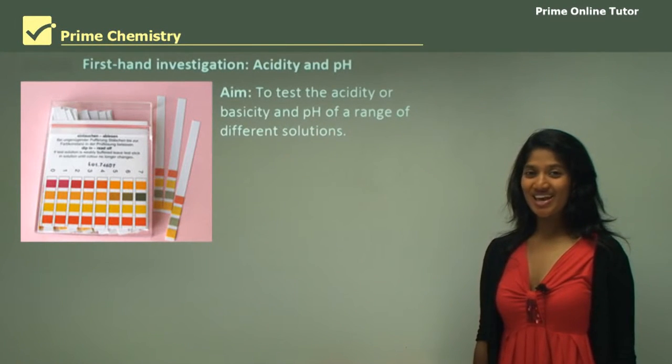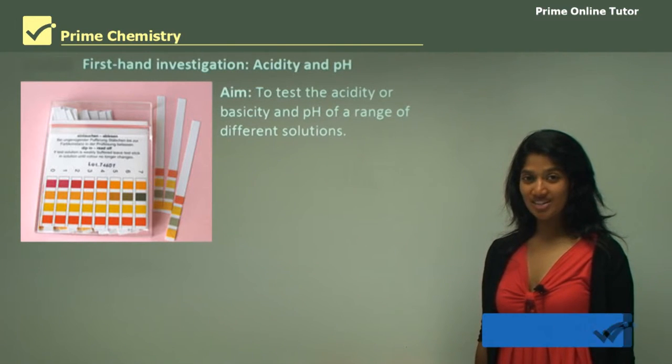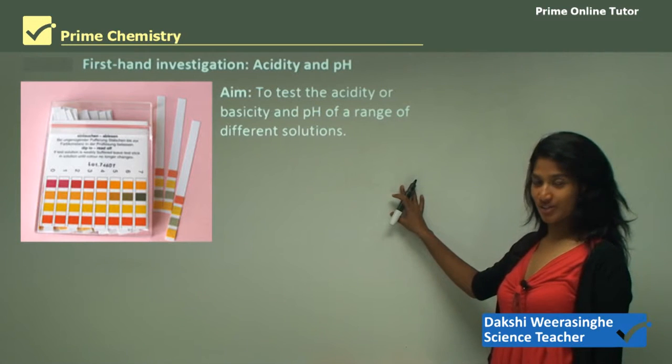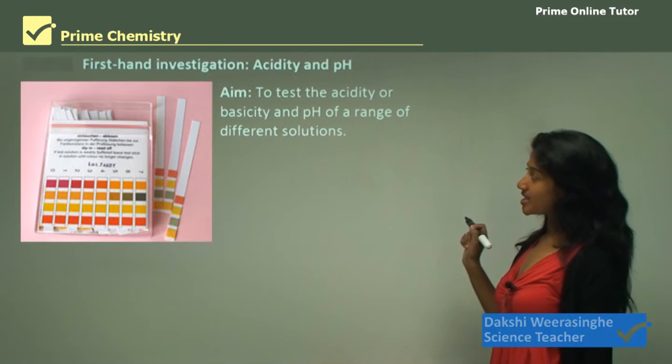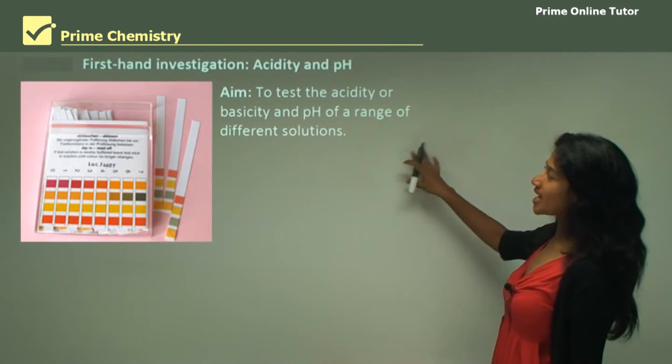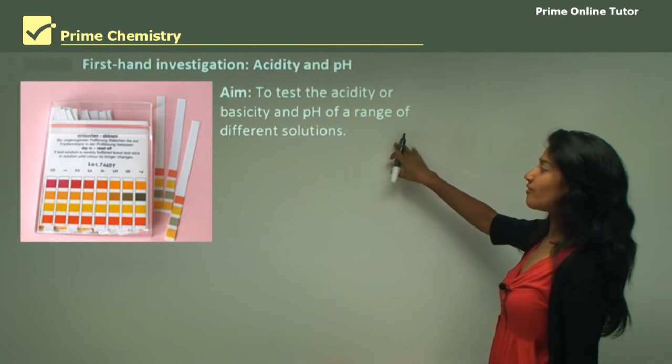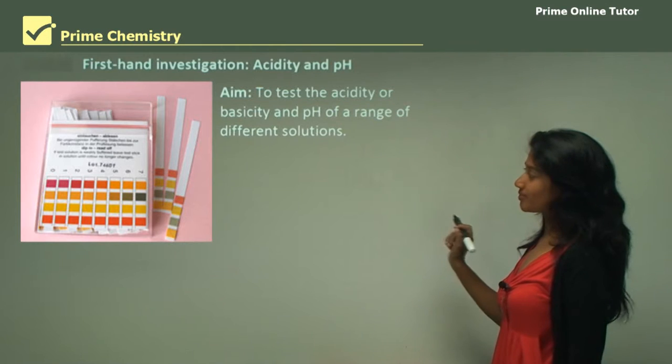Hello everyone, today we will be going through a first-hand investigation where we will be testing the pH of a variety of solutions. So the aim of the experiment is going to be to test the acidity or basicity and the pH of a range of different solutions.